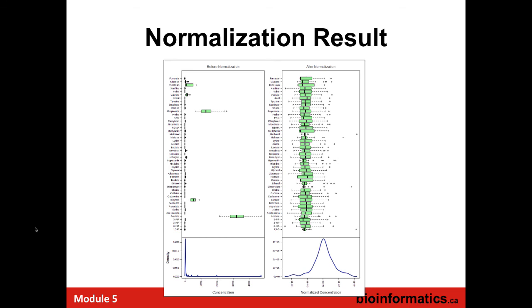Assessing whether this looks normal is really up to your eye. This is where statistics becomes a bit of an art. I usually say statistics is the mathematics of intuition. It just formalizes what we might intuitively see in a mathematical framework. And this is another example of intuition. Does this look Gaussian to you? Some of you say, no, it's not enough, I want to do some more. Okay, you can. You're working with a slightly different distribution, and depending on what you've done, you will get slightly different results. Not profoundly, but slightly different, depending on what you've done to normalize and scale.